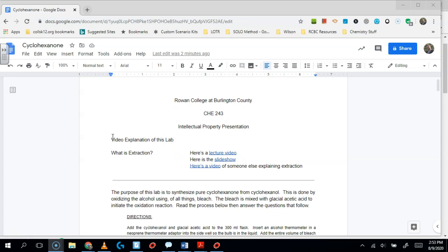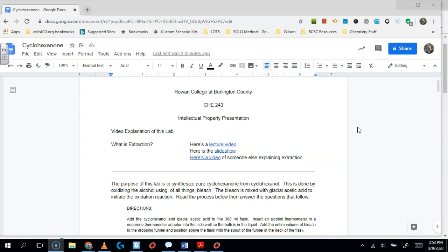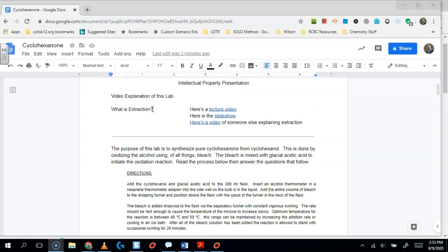So you'll see, again, if you're watching this, that means you're already watching the video explanation. And then in Organic 2, we're going to make sure that you get some really solid foundation on chemical separation principles and lab principles. So we want you to watch this extraction video. This is a video that explains how to do extraction and maybe why it's done. If this doesn't float your boat, you can always watch this video here. That's a video of Professor Dave explaining how to do extraction. It's a really good video, and sometimes you just need to see a different point of view.